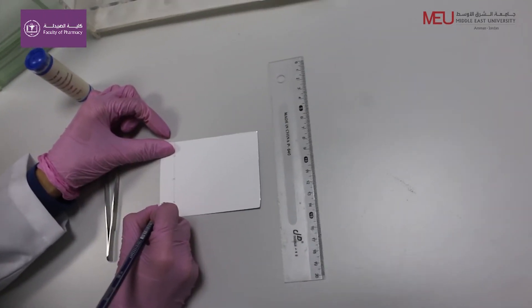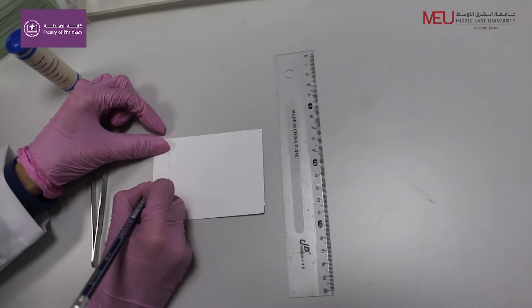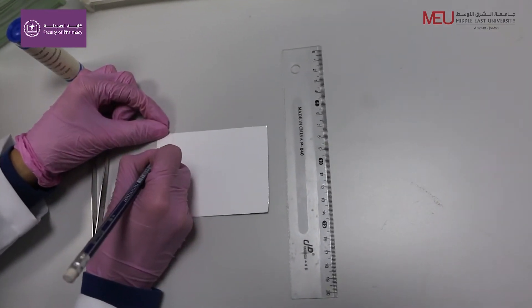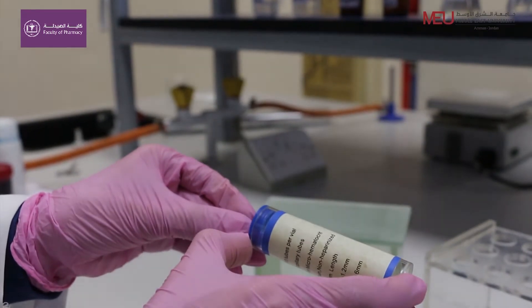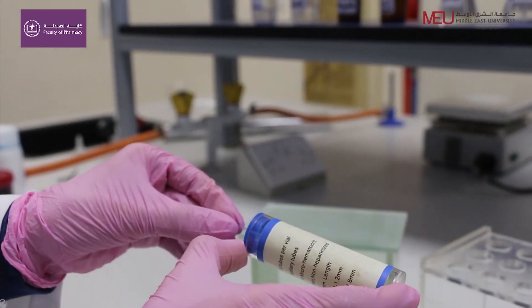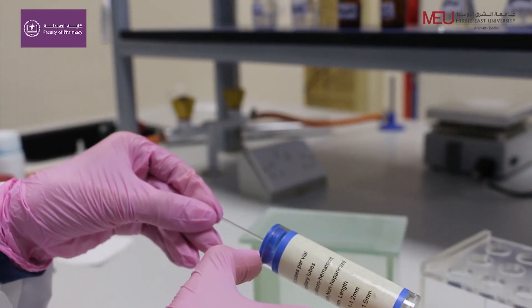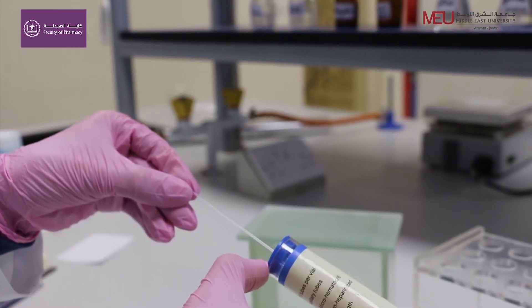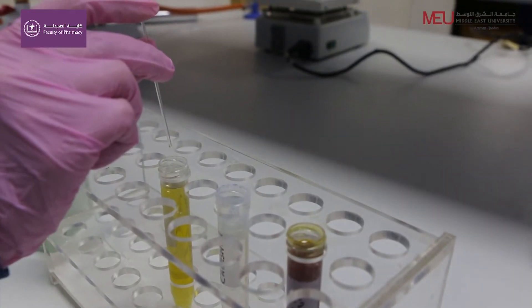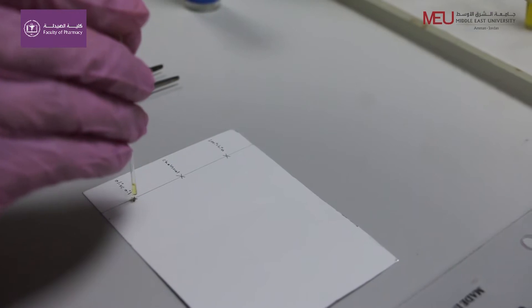Label each position with your known or unknown compounds. Using micro capillary tubes, apply your compound onto the plate. The tube is fragile, so please handle with care. Place the capillary tube into your lipid samples.